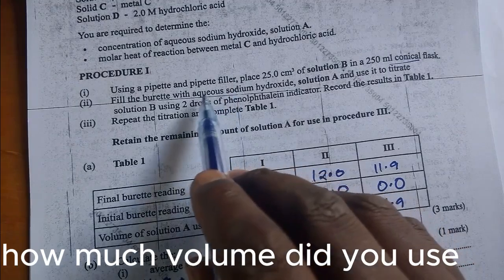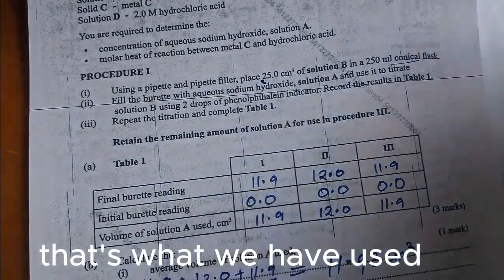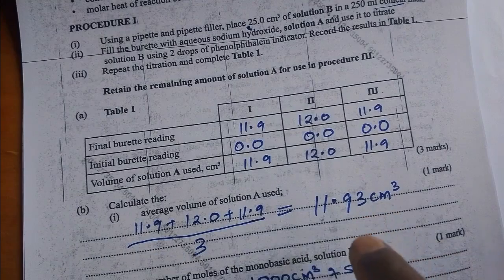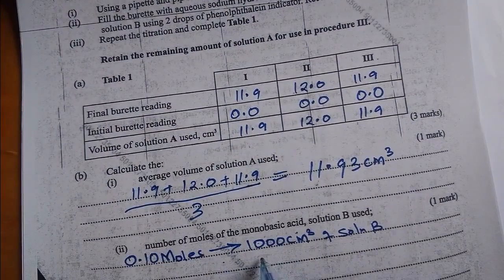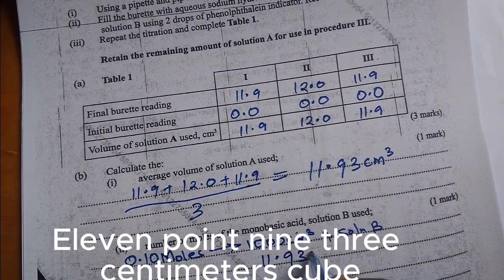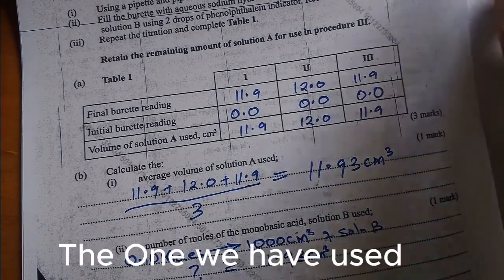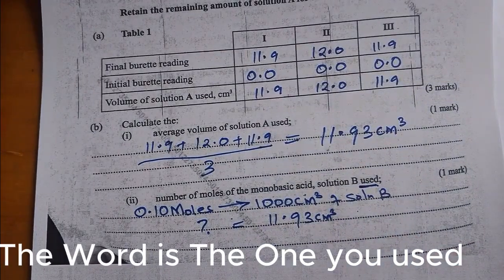How much volume did you use? We used 25 of solution B. That's what has reacted with the 11.93 together. Therefore, we ask here, 11.93 centimeters cube of this solution will contain how many moles? The one we have used. Remember, the word is the one you used.